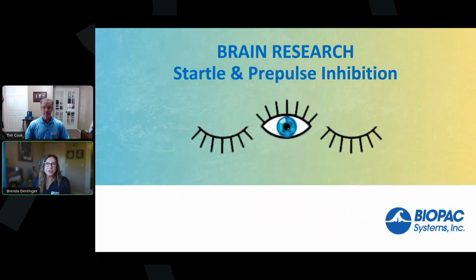Brain Research, Startle and Prepulse Inhibition. We are going to show you how to get started with this type of research, and also we'll talk about best practices if you're already familiar.